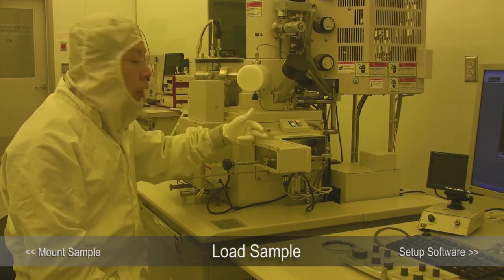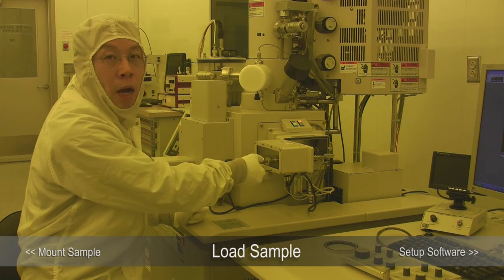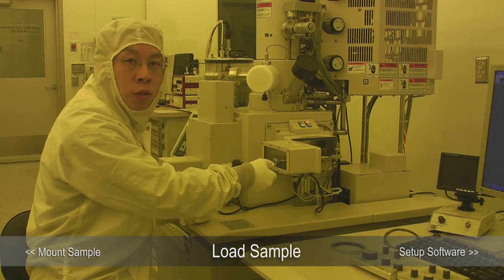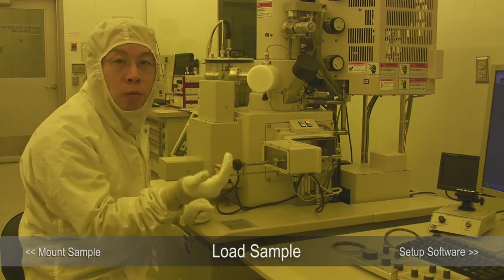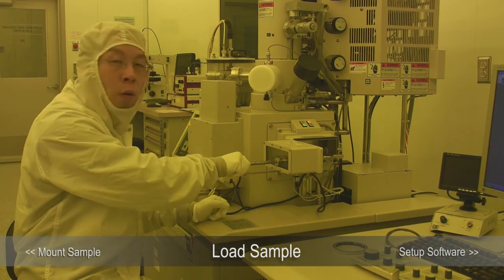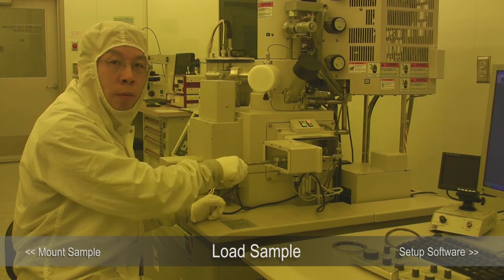When you handle the exchange lock, you don't want to touch the metal part here. We put vacuum grease on there. If everybody touches the exchange lock on the metal part, the vacuum grease will be gone and it will become very stiff to move in and out. So always handle the exchange lock with the black handle.